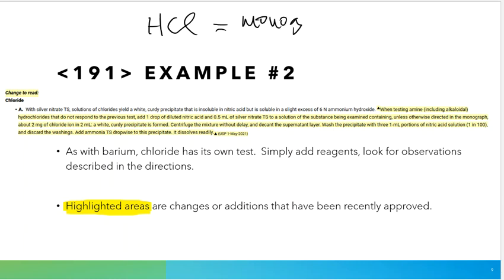And the HCl monograph, you know, that's great. Yeah, absolutely. But that's only one thing that has chloride present. I mean, there's tons of things that have chloride out there. And if it has chloride, then this test is fair game. So I'm going to see multiple things referencing 191 chloride test possibly throughout the entire monograph textbook or reference book. Tons of material could have chloride present in the structure. HCl is just one of those.